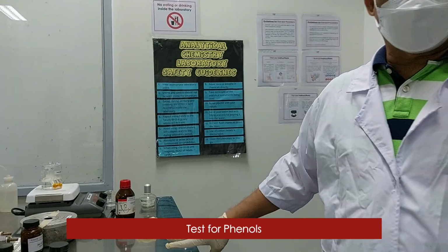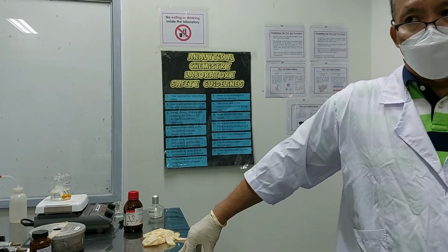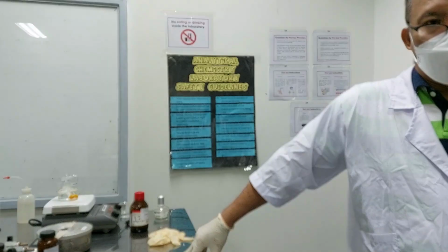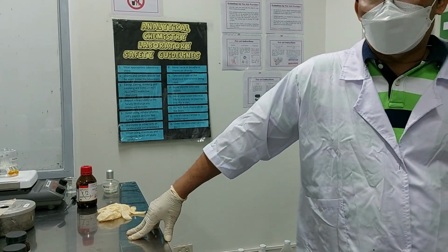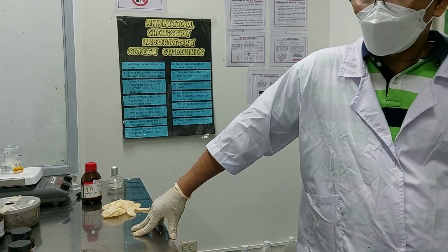The next experiment is the test for phenols. Phenols are aromatic compounds, and the test is very important because phenol is a representative of natural products called flavonoids.